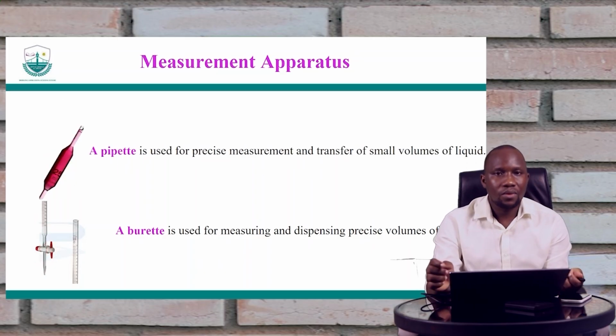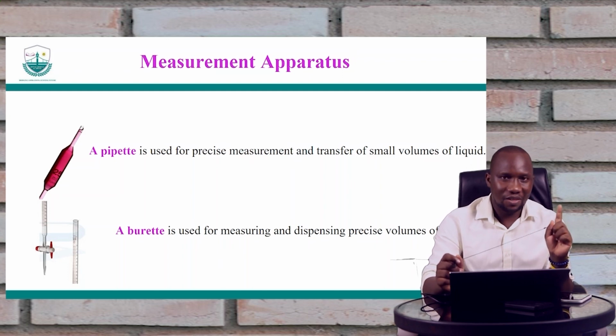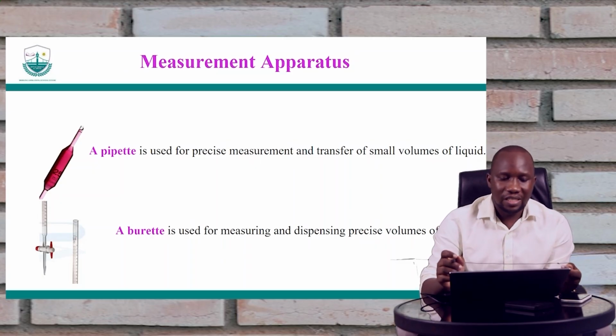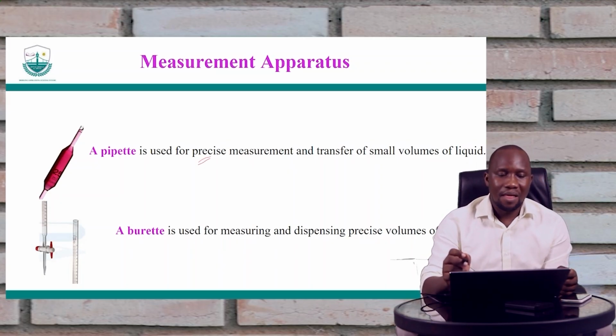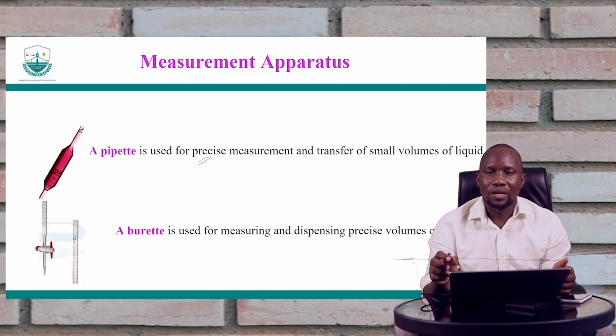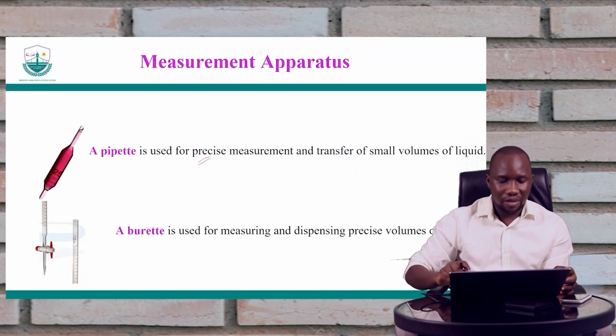And then we have a pipette. A pipette also has a graduation, you can see, right? 25 mils. We have others of different volumes. So still, it is used for measurement, but it provides precise measurements for transferring to another apparatus for holding liquids. Okay, and then the burette, we have looked at it, I think, here. Just had a repeat.